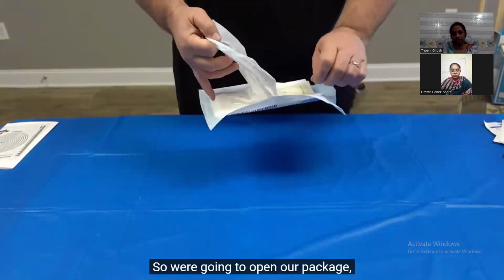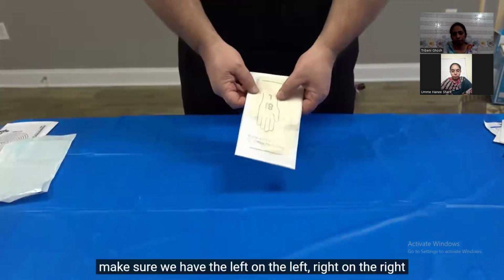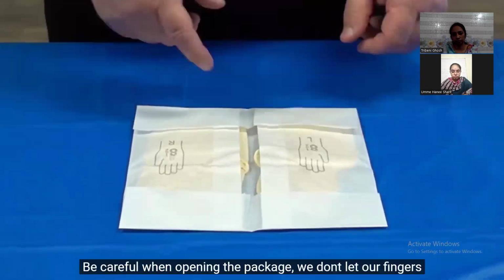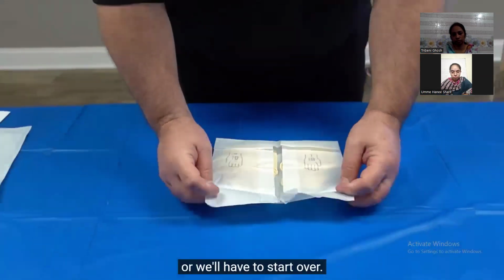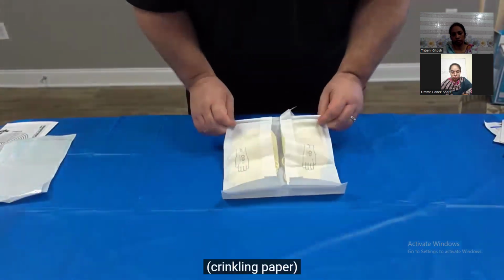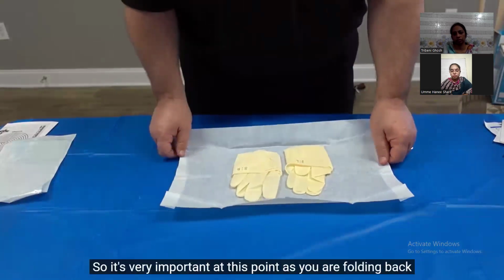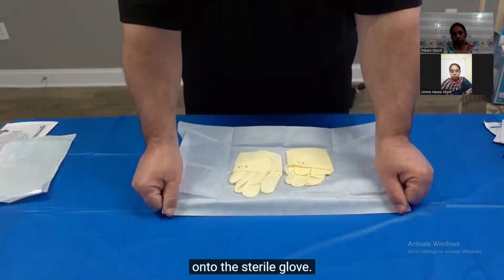Open the package and slide our gloves out. Make sure we have the left on the left, right on the right. Be careful when opening the package that we don't let our fingers accidentally touch the area where the gloves are exposed, or we'll have to start over. It is very important as you're folding back that paper to ensure it doesn't flip back over onto the sterile glove.